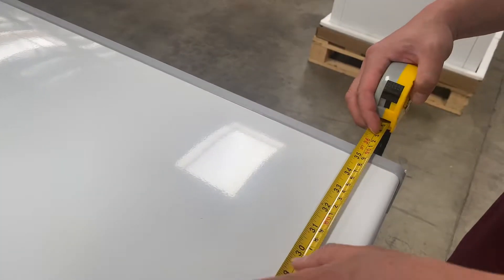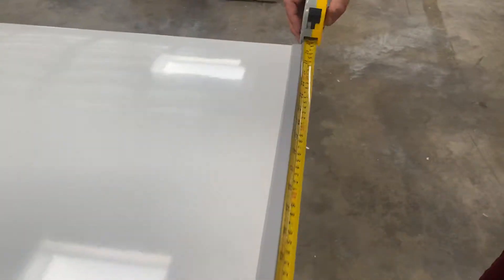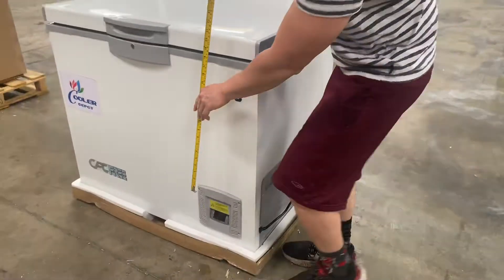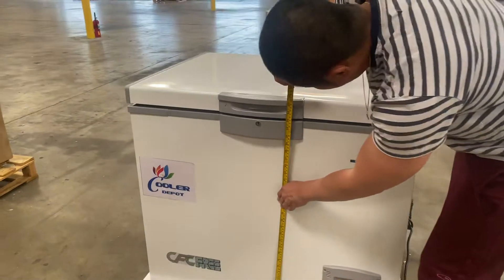For the length we have 35 and a half inches, for the depth 26 and a half inches, and for the height we have 31 inches — 30 and a half inches tall.